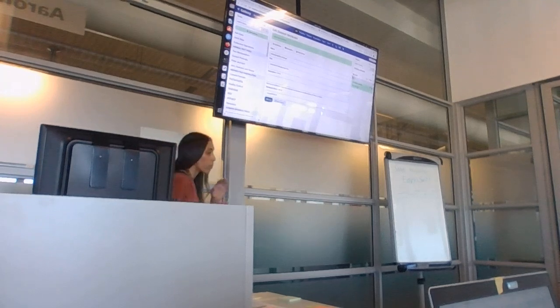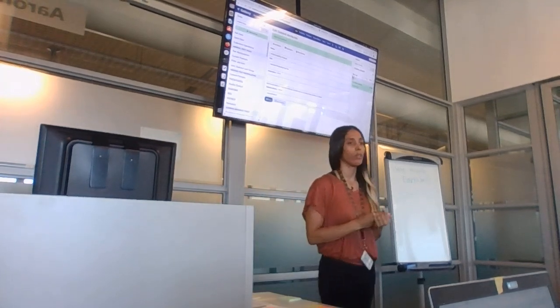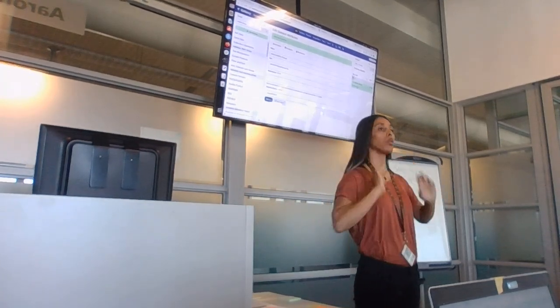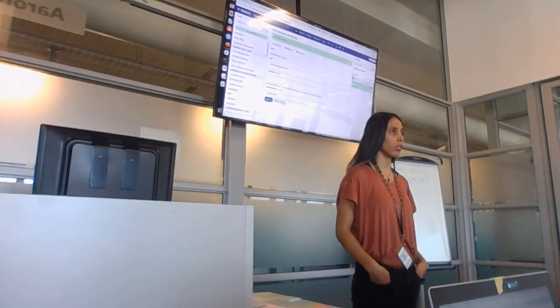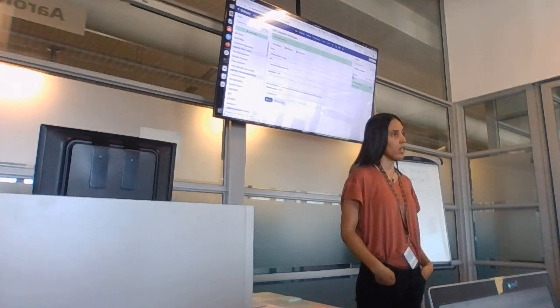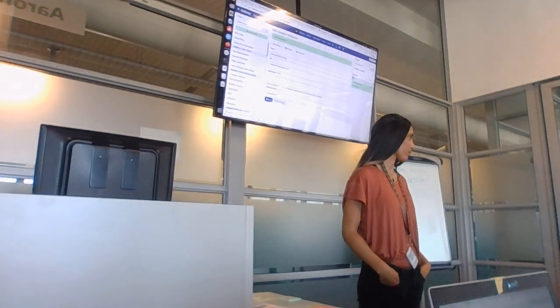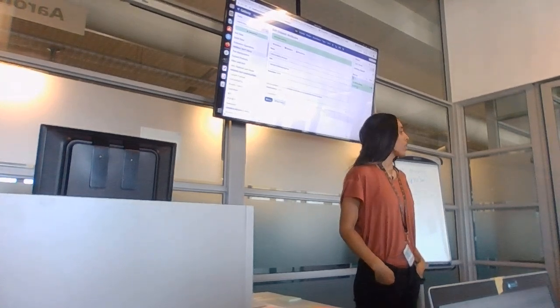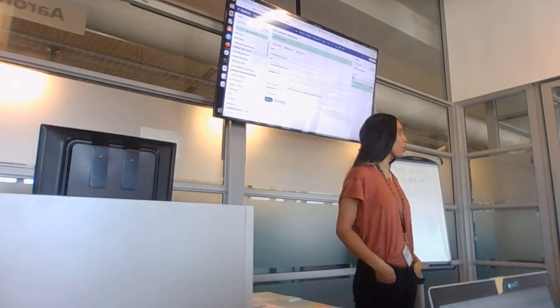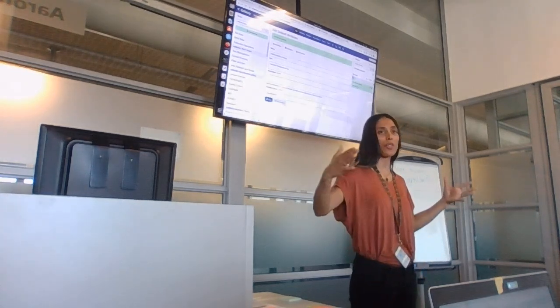Okay, so again, when would you build a workflow? If somebody asked you to do an analysis on some fungus, right? It's just something of interest to them. You're building this, you're running fastq, you're doing variant calling, whatever, 5, 6 different steps.